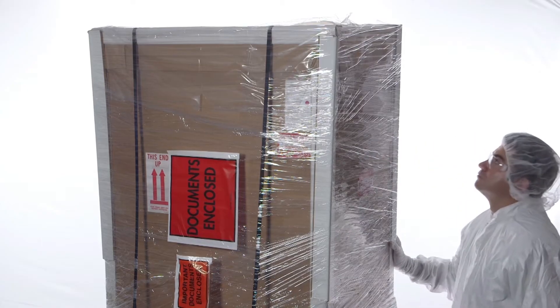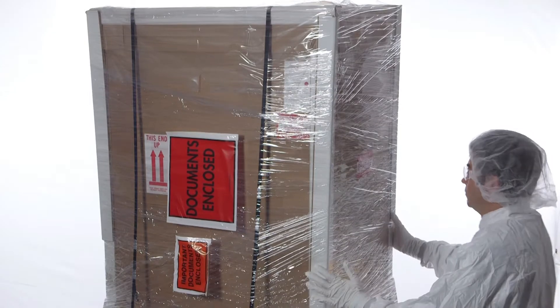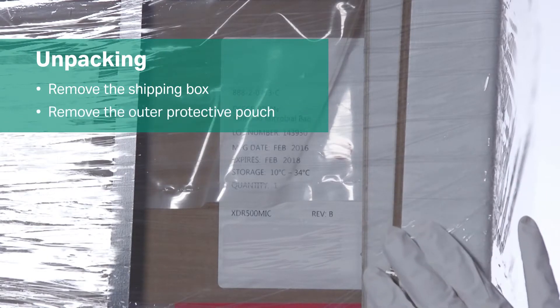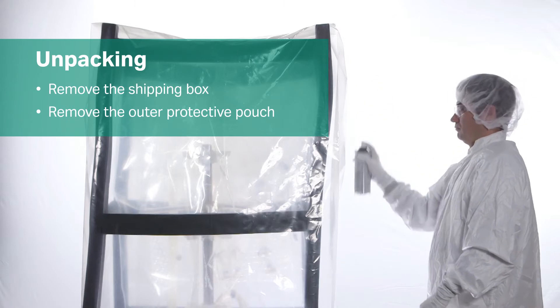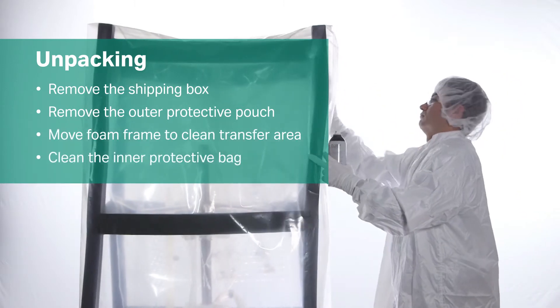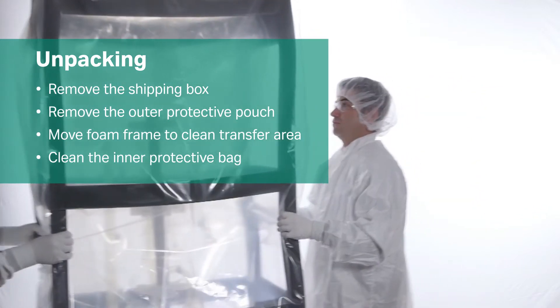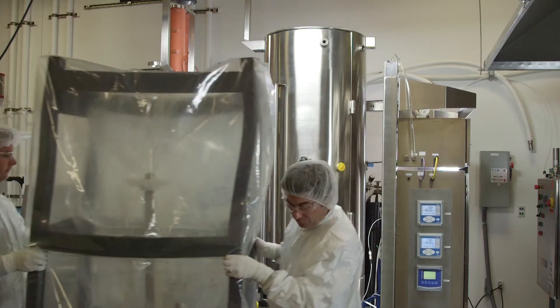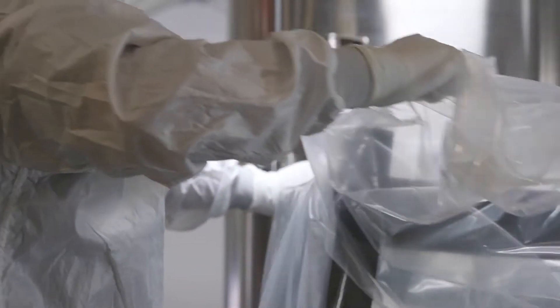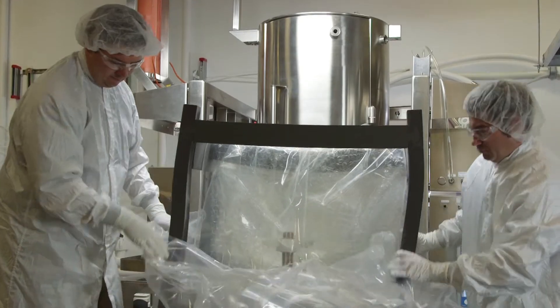The disposable fermentation bag is securely packed for transport. Unpack the shipping box and remove the outer protective pouch, and move the foam frame to a clean transfer area. Clean the inner protective bag before moving it to the fermentor. The disposable bag needs to be handled with care. Avoid using scissors or cutters throughout the installation process.